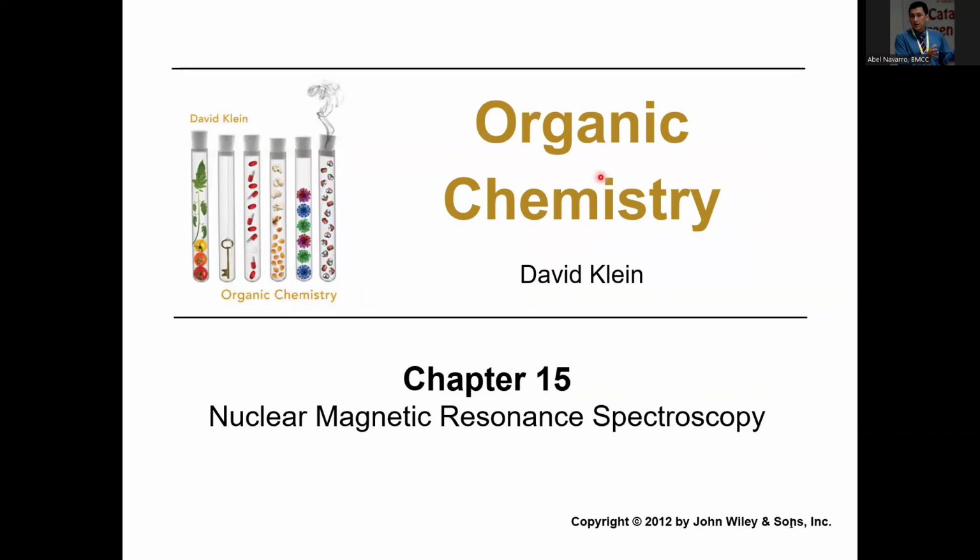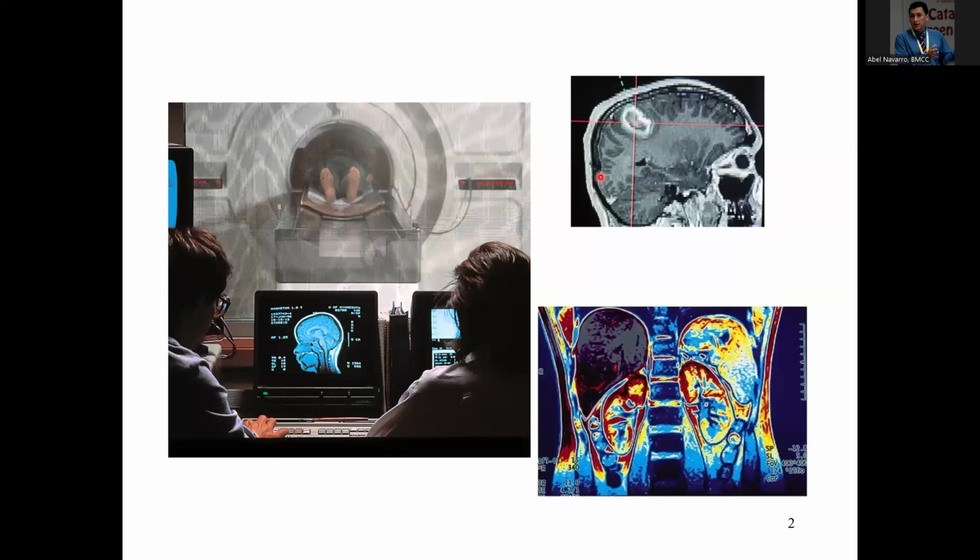So even though the first slide didn't really mention it clearly, we are going to be studying or focusing more on hydrogen NMR. There are some other types of NMRs that you can do, but we will focus on hydrogen NMR. We will do a little bit of carbon NMR as well, but basically it's going to be hydrogen NMR. Why hydrogen? Because 99.9% of organic compounds all contain hydrogen. Methane, acetone, ethanol, tert-butanol, benzene, gasoline, aspirin, ibuprofen, naproxen, amoxicillin, they all contain hydrogen. So that's why it's a very powerful tool, because hydrogen is everywhere. Since hydrogen is in most of the organic compounds, that's why it is used.